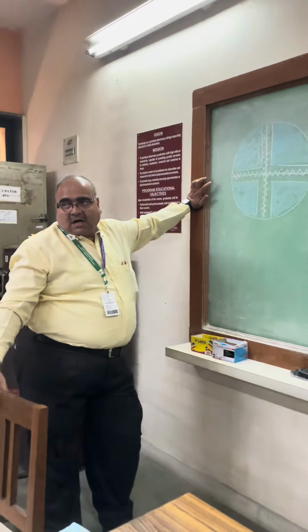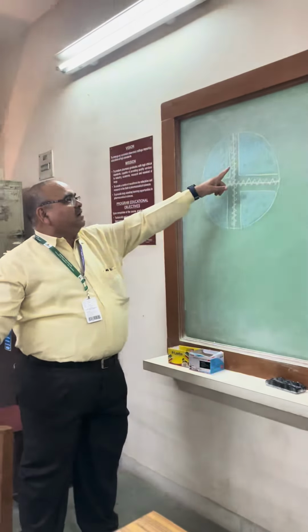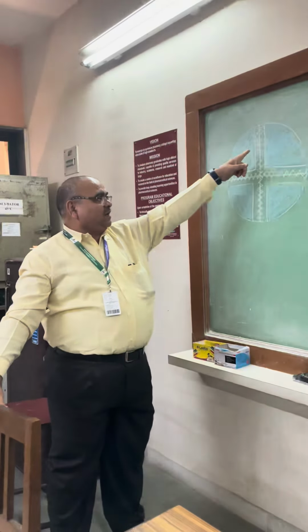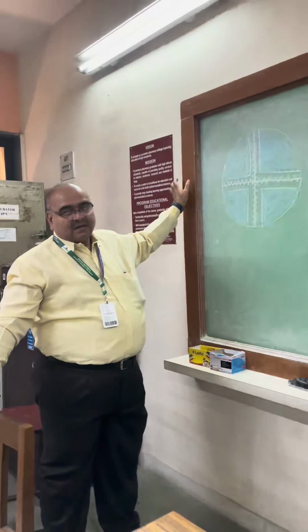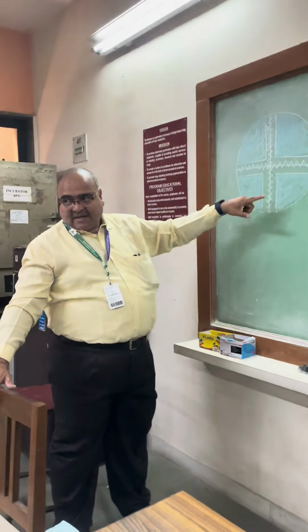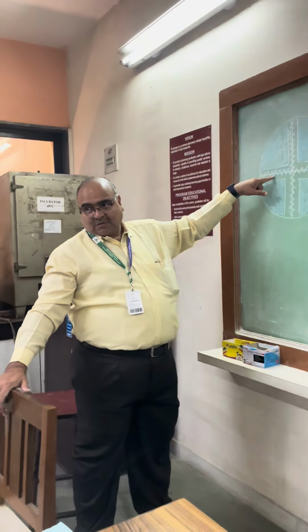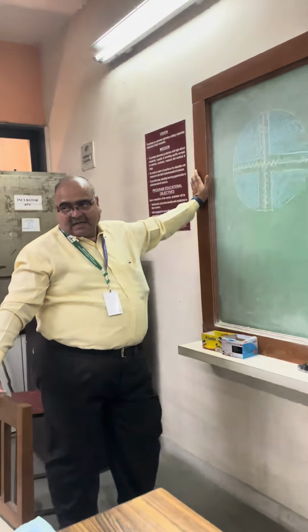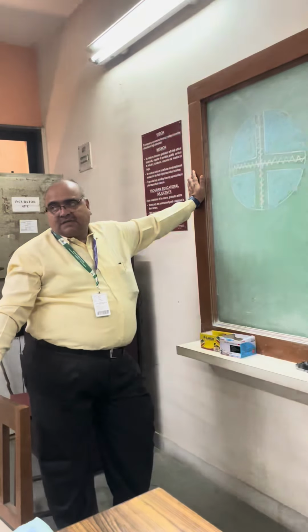This is amylase positive. Surrounding this inoculated area, when the colorless zone is seen, it indicates amylase positive. If the bacteria are amylase negative, then the blue coloration will be seen up to this position. This portion will be dark yellow in color. Have you understood the amylase test?